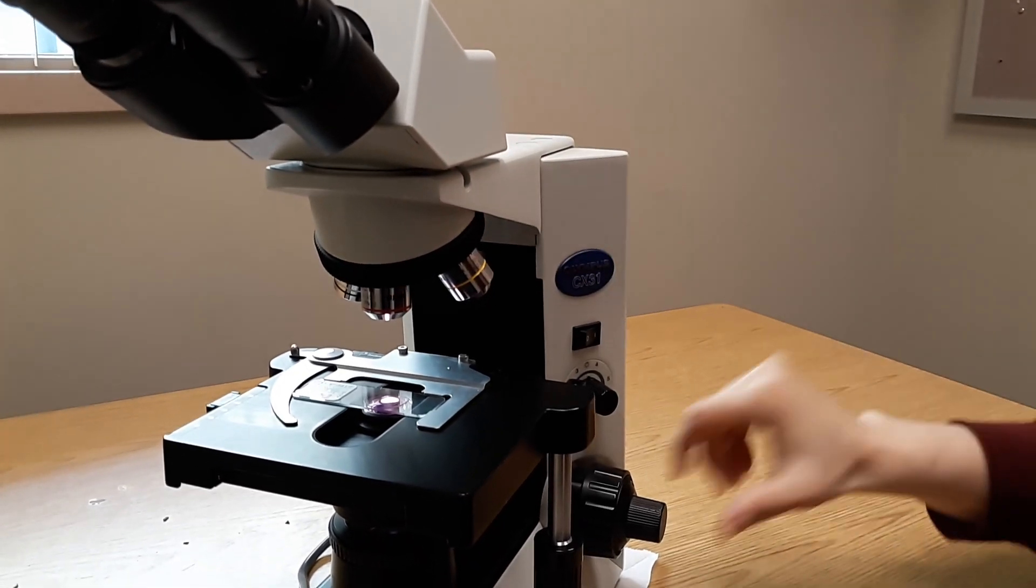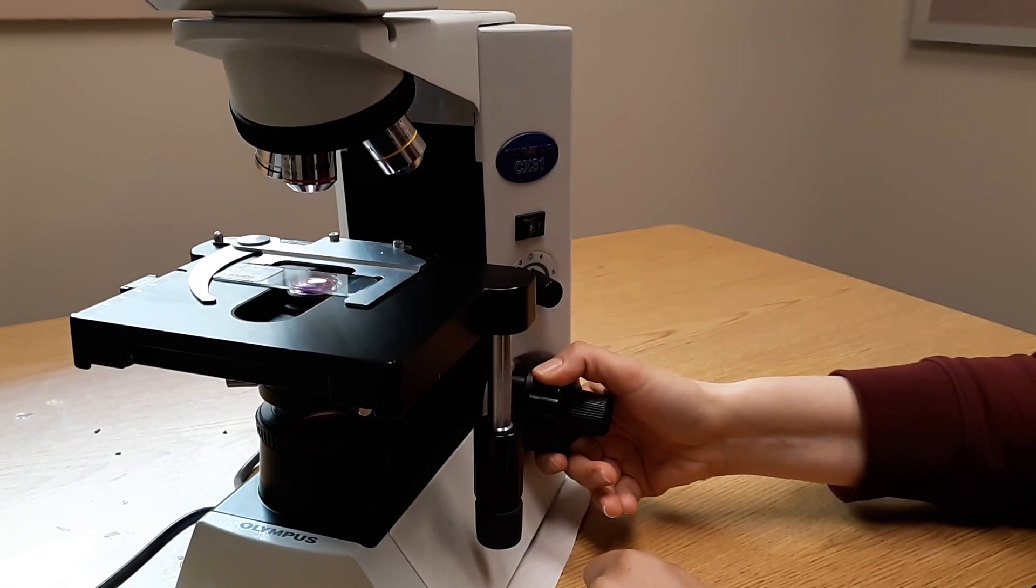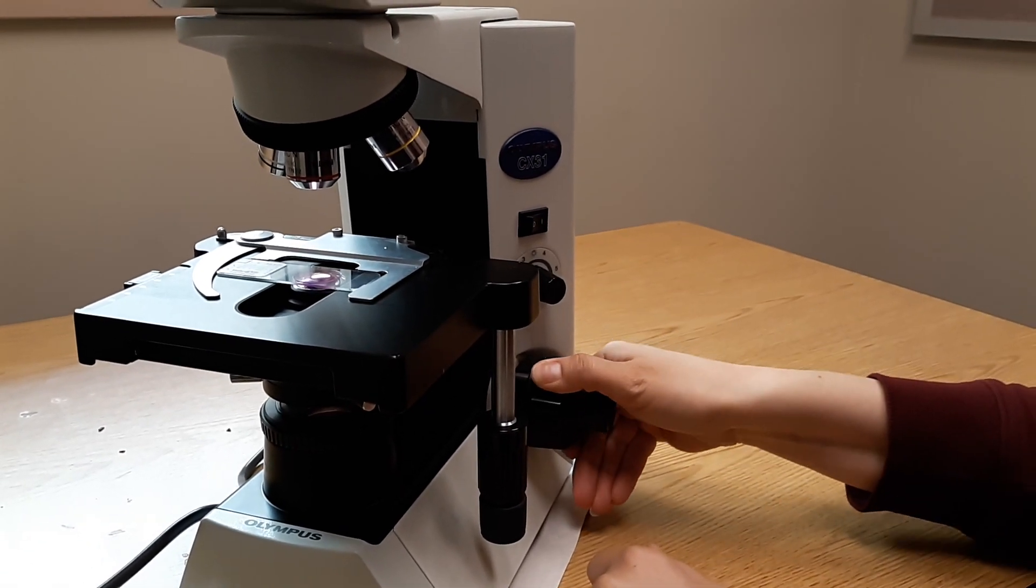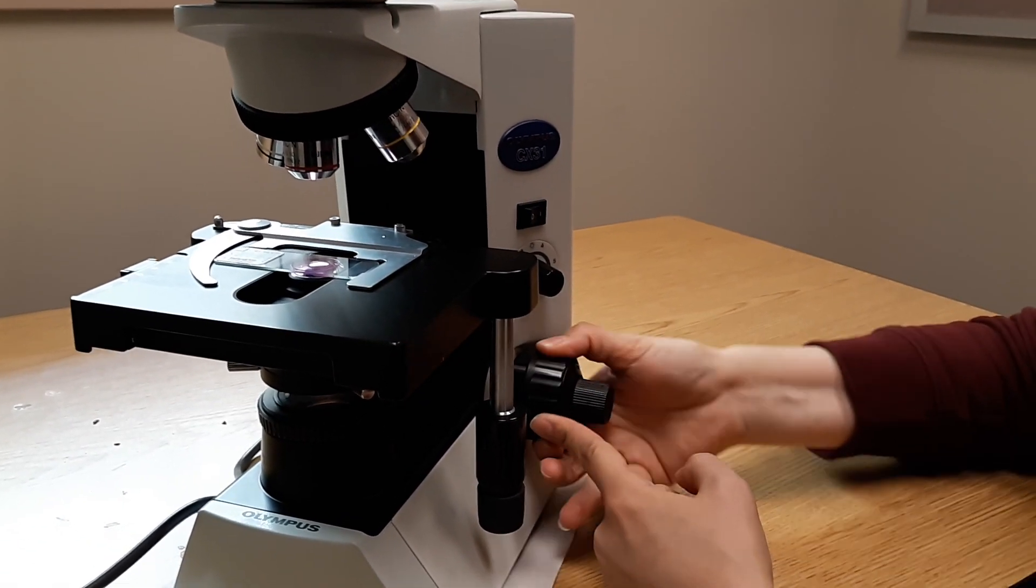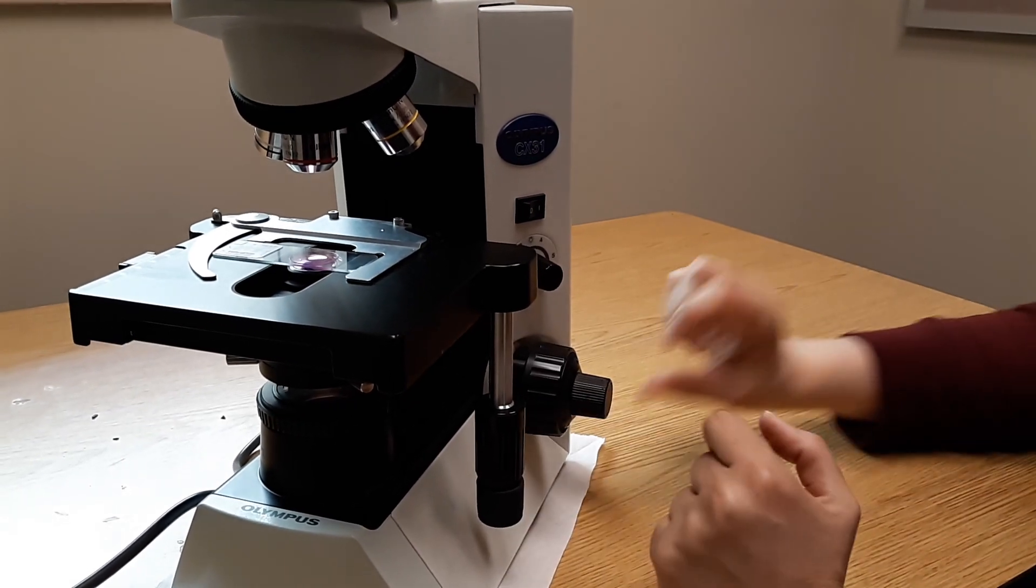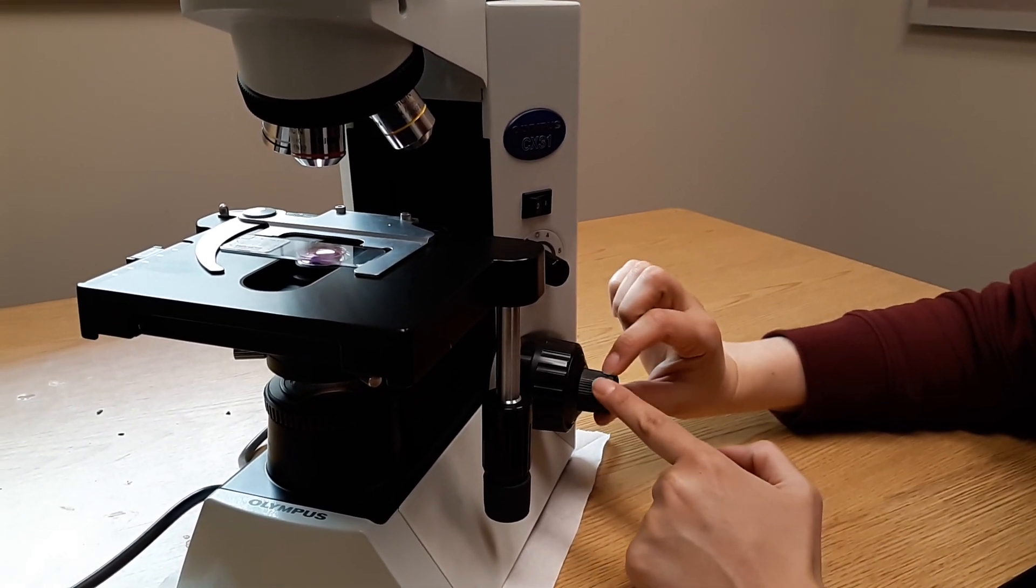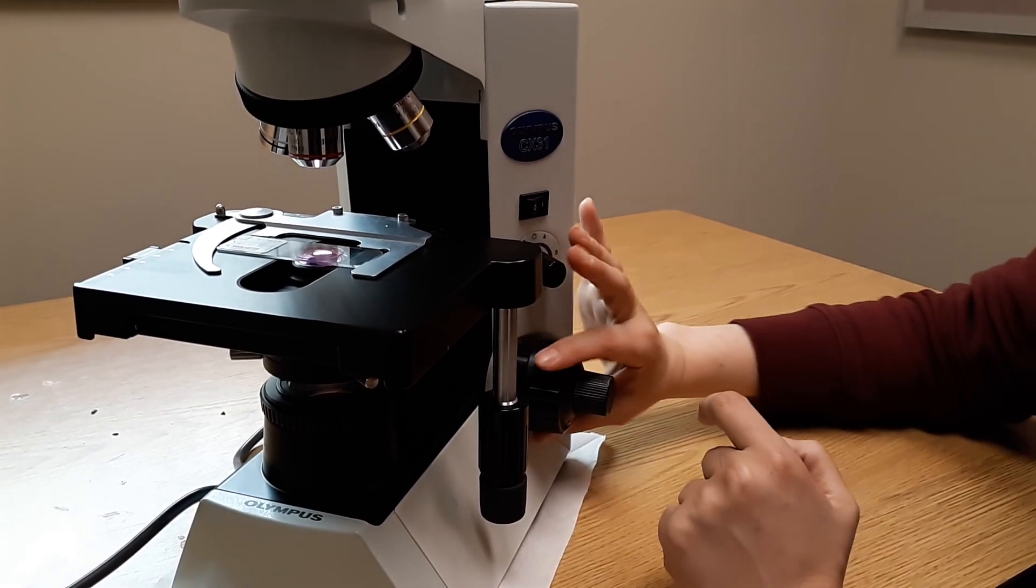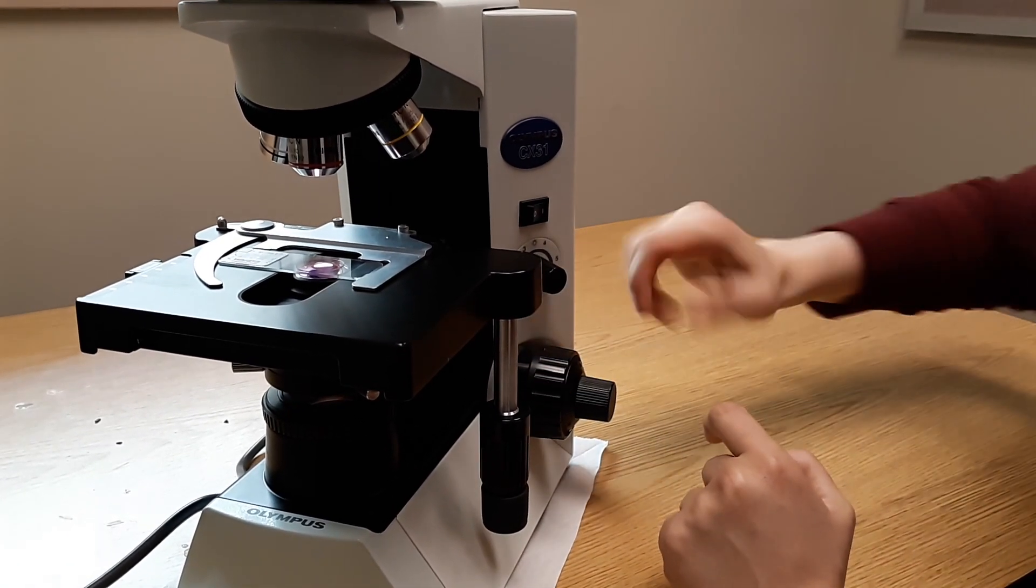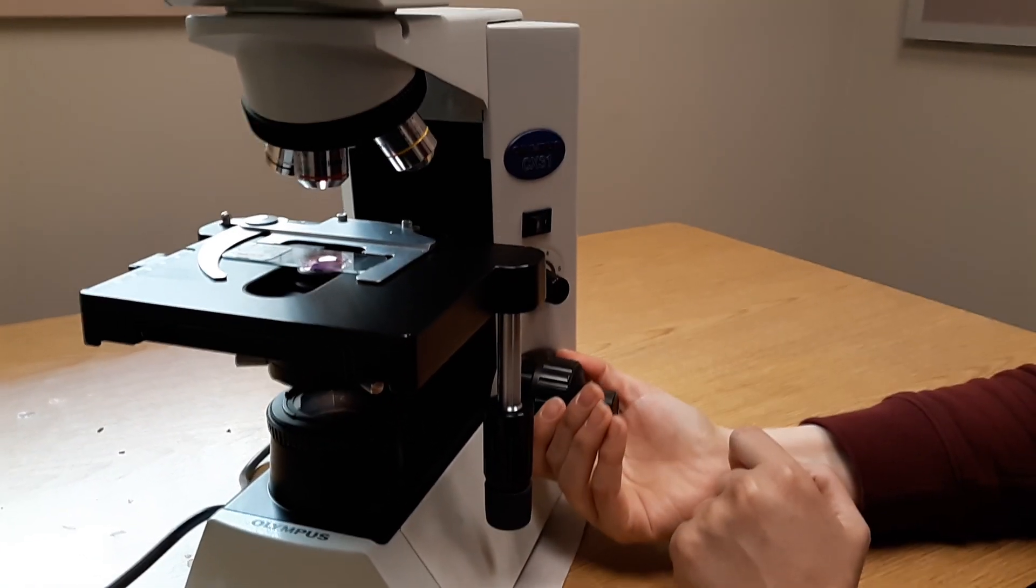There's a couple of methods, but the one we'll teach you is you can rotate up. This is the coarse focus, which moves quite a great deal of distance, and this is the fine focus. The fine focus takes the blur out, while the coarse focus allows you to get the specimen initially into focus.